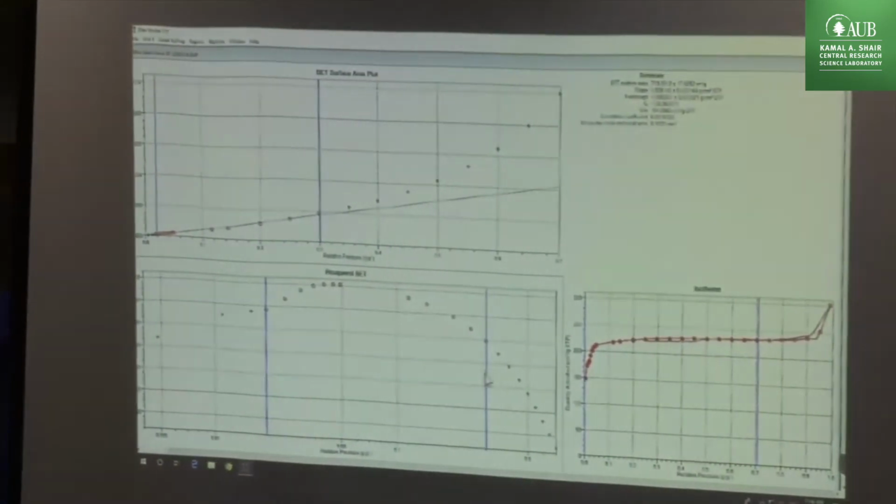So this is our limit, but it depends on the size of the pore. Sometimes my limit could be 0.2, 0.3, I don't know, 0.25. Then Rouquerol wrote a very nice equation to tell you where your best fitting is. So now I come to Rouquerol and, since it says negative here, I need to adjust it.